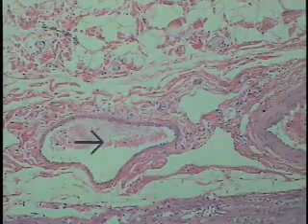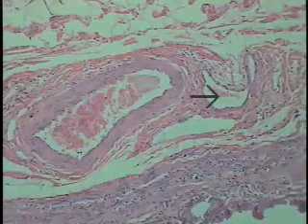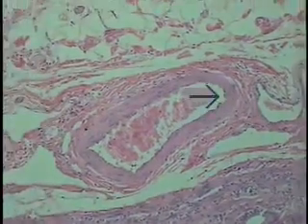Associated with it are its companion small veins, because it's here. Let's just go ahead and point it out, and there's another companion vein on the other side. So this one has two small veins accompanying the artery. Now, having located one, then examine it at increased magnification.